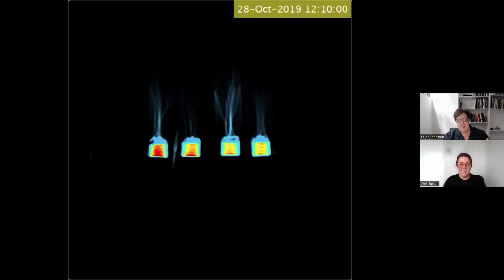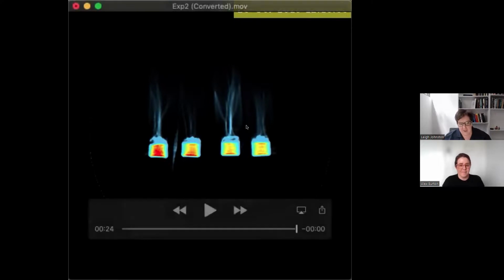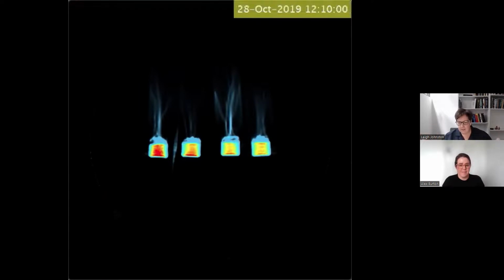But you can see that this gives plant scientists a completely different way to do their experiments, because without access to the 3-dimensional imaging techniques, the way that they do it is that they have a whole bunch of plants and they add radioactivity to it. And then at different points in time, they go away and slice and dice the plants and do a radioactive detection on it, and then make up the same kind of graphs that we can do without butchering any of the plants over the time.